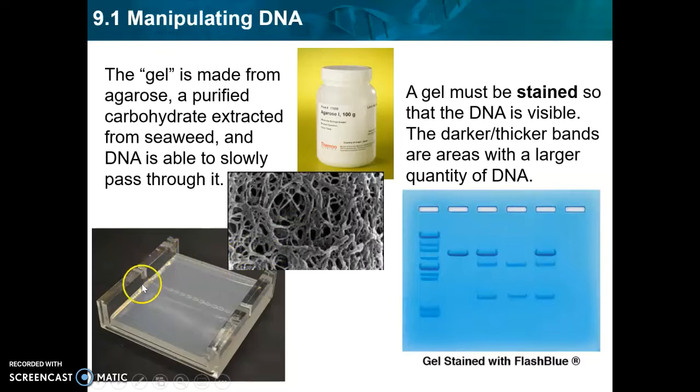The gel itself is going to look like this. So you can't see those holes to the naked eye. You have to use a microscope to see it. But here are all of those wells. That's where you would load your DNA sample. This gel actually has 2 rows of wells, so 2 places where DNA can be loaded. That's the kind of gel we will use in class.